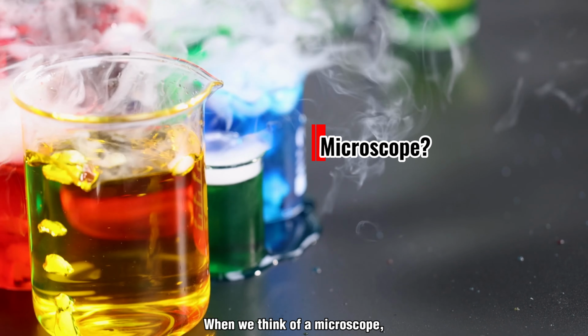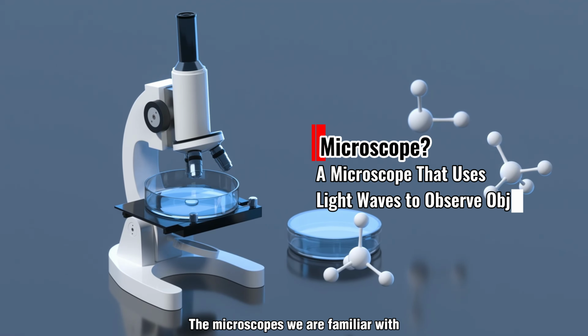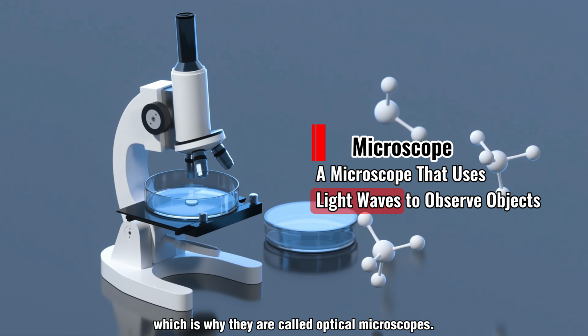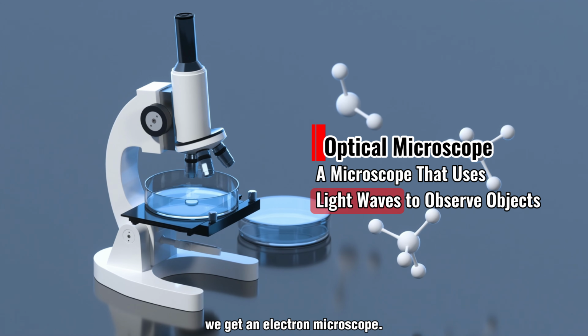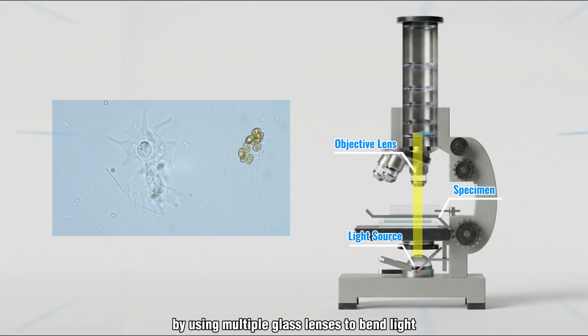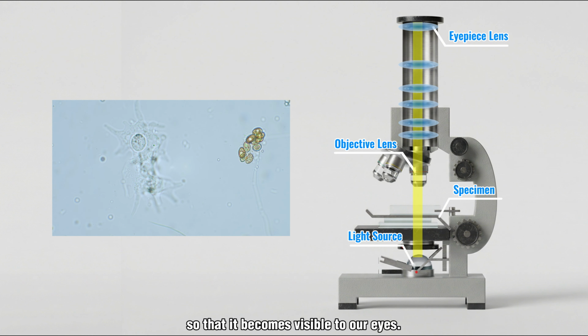When we think of a microscope, we probably picture something like what you see on the screen right now. The microscopes we are familiar with use light waves to observe objects, which is why they are called optical microscopes. And if we use electrons instead of light, we get an electron microscope. An optical microscope works by using multiple glass lenses to bend light and gradually magnify the image of an object so that it becomes visible to our eyes.